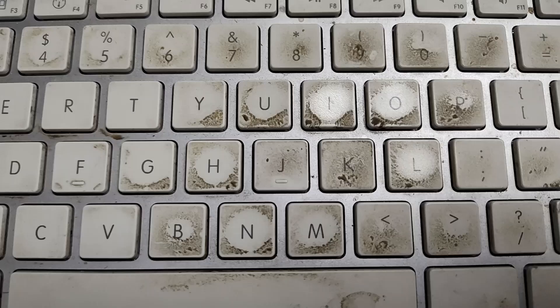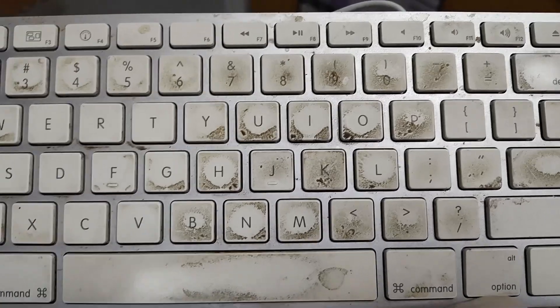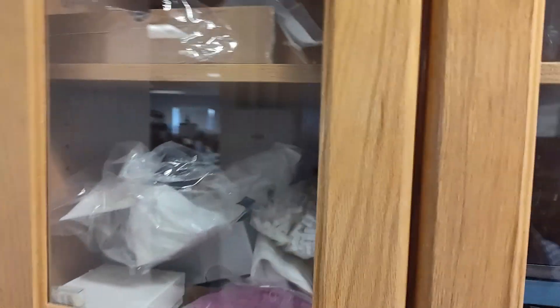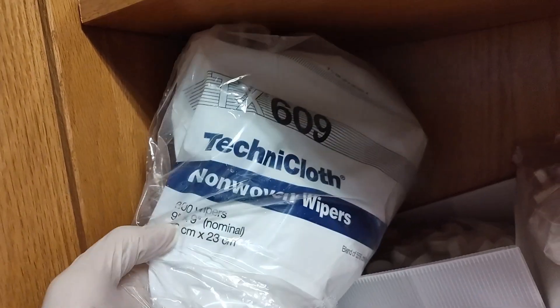Let's go ahead and clean this keyboard with isopropanol — I've read that's the best solvent — with a clean wipe, and then extract it out and see what it is. What is the finger goo on keyboards? A clean science wipe is what we need. I use these wipes called Technicloth; these are non-woven wipers that clean room people use.